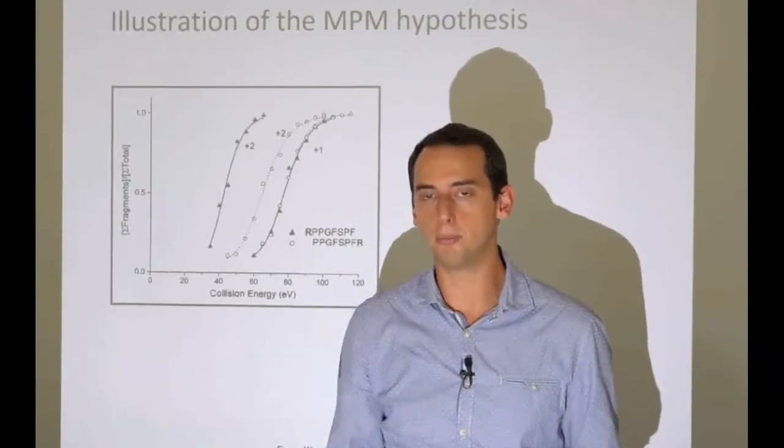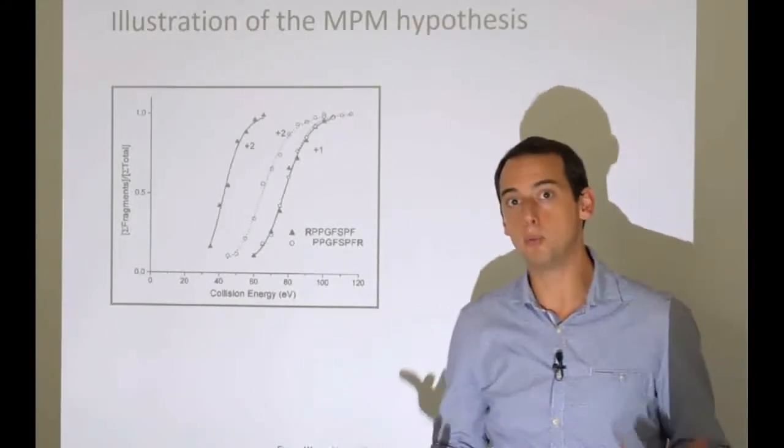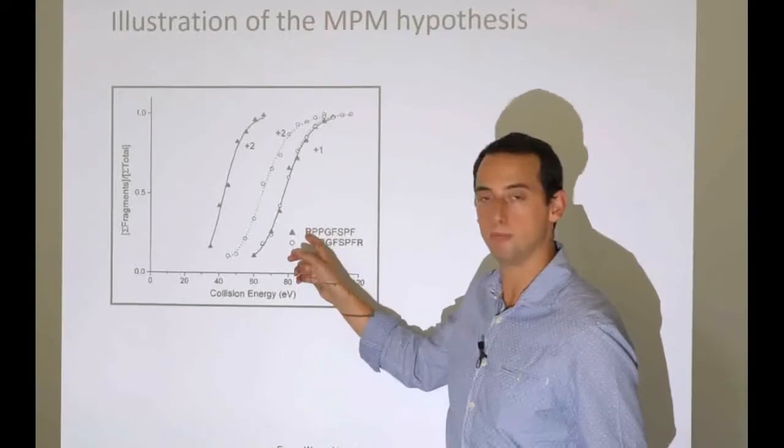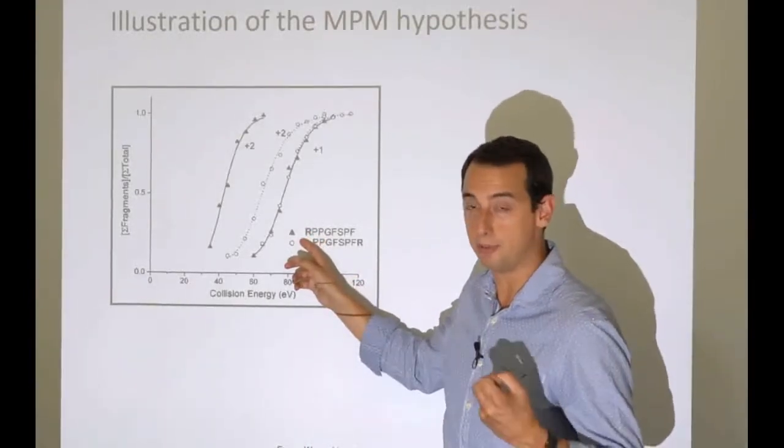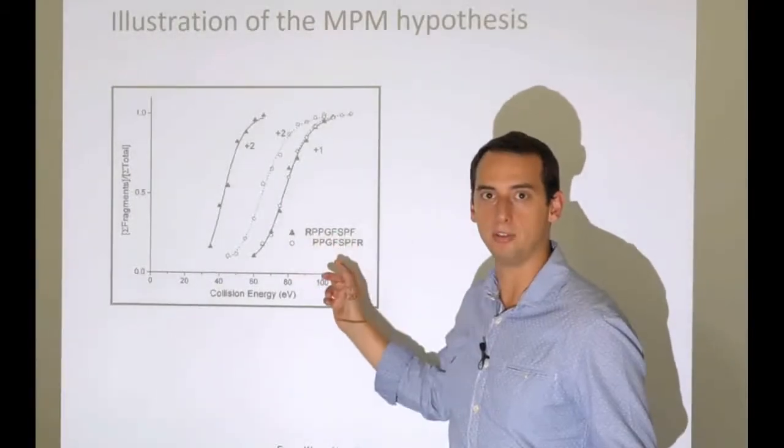If the proton is not mobile, it's very tricky to get the thing to fragment. And if you have only one location where the proton is happy to be, and if you have only one proton, it doesn't even matter where that location is.